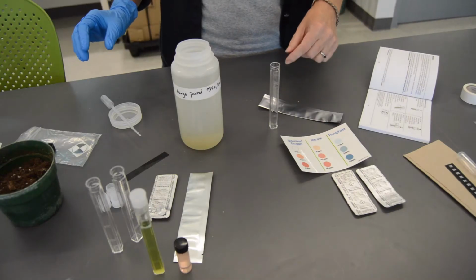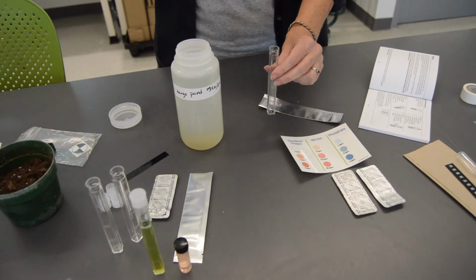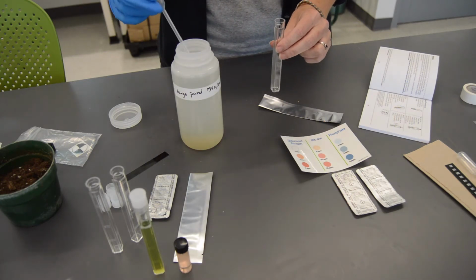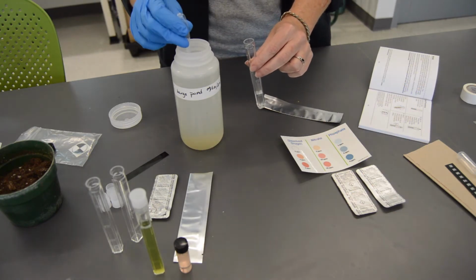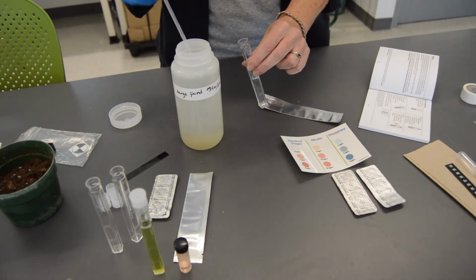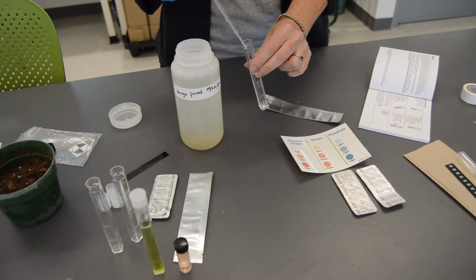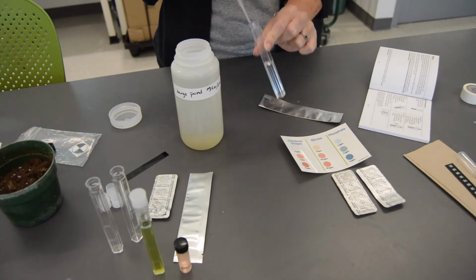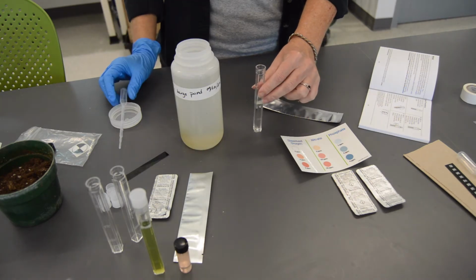Next, we're testing for nitrate in our water, so this is an indicator of nutrient levels. You're going to find this in fertilizers and other sources that participate in our nitrogen cycle. So again, I'm just filling up to get a good sample level. We want to do about 5 for this one. So I've got it at the 5 milliliter mark.